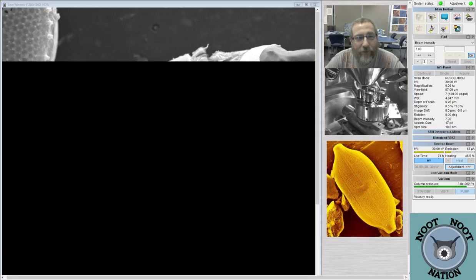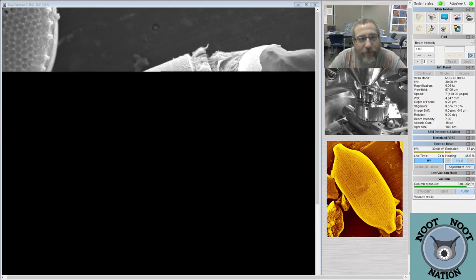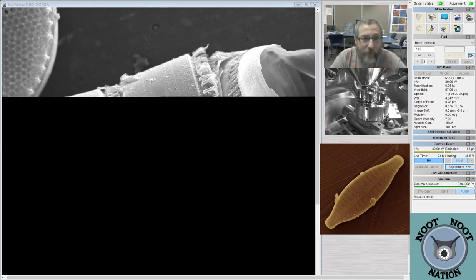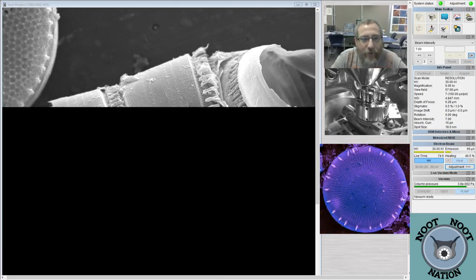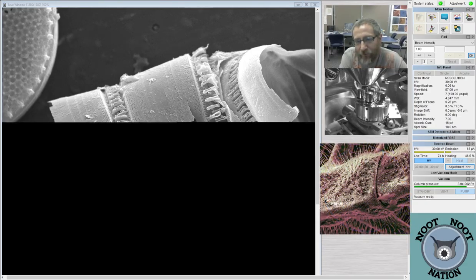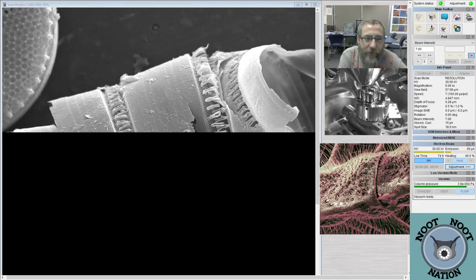Yeah, so these are some plankton samples, and there's a lot of interesting stuff going on. I'd say just browsing around in here, I found maybe a dozen things that I haven't seen in any of the samples you've sent me previously. Wow. Well, between this one and the one before, right? I think we've seen Stephanopyxis on your streams, but not except for just recently, right? Yeah. It just started showing up.